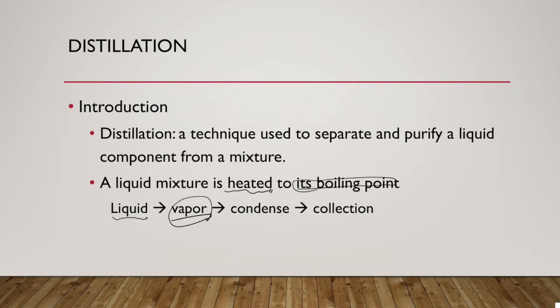But then these vapors escape from the apparatus, and eventually, once they reach the cold area in the apparatus setup, they will condense, and we're going to collect those condensates. And that's basically how distillation works. We just boil the liquid mixture, and based on their boiling points, we can separate them.